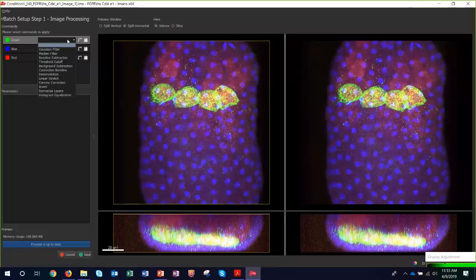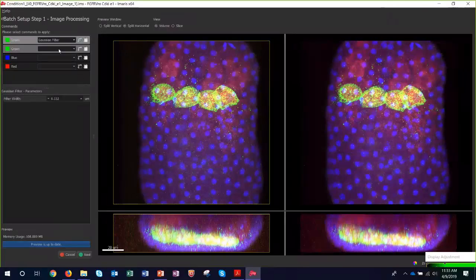Previously they would bring up a whole new window, and that's how you would work with them. What we've done now is instead we have the split view. The great thing about this is that I immediately see my original data set, and then on the right-hand side, I see my processed data set.